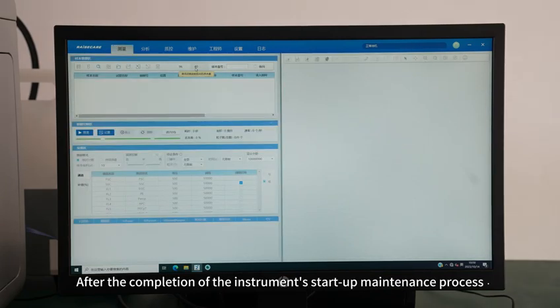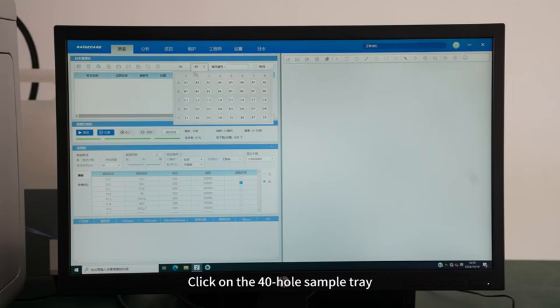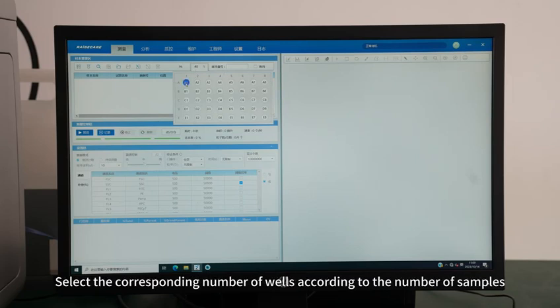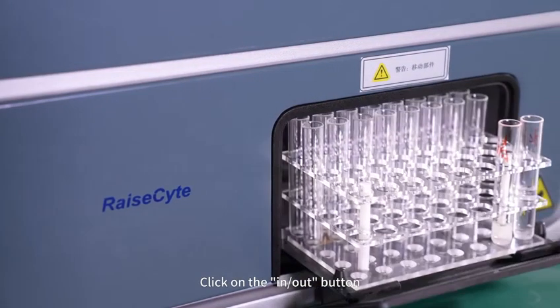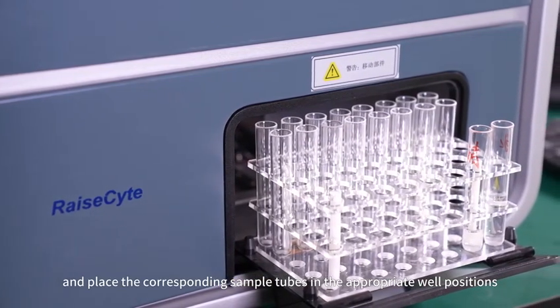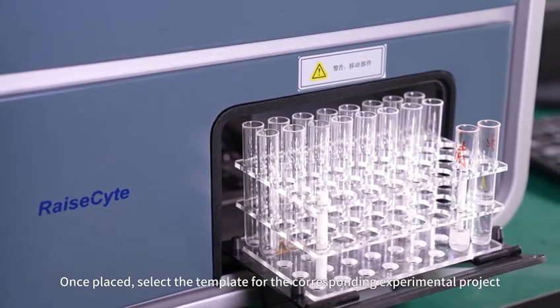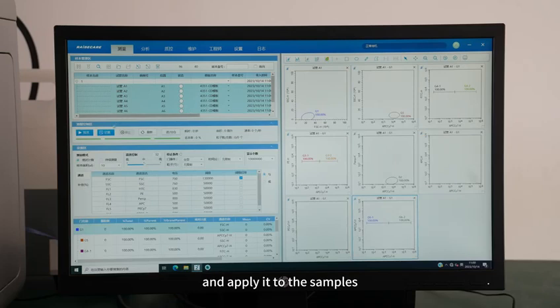After the completion of the instrument startup maintenance process, you can proceed with the operation. On the measurement interface, click on the 40-hole sample tree. Select the corresponding number of wells according to the number of samples. Then create a new sample. Click on the In and Out button and place the corresponding sample tubes in the appropriate well positions. Once placed, select the template for the corresponding experimental project and apply it to the samples. Select the samples that need to be run and click on the Record button.